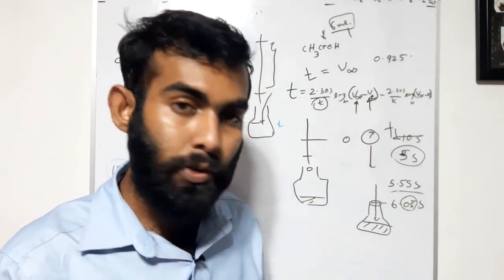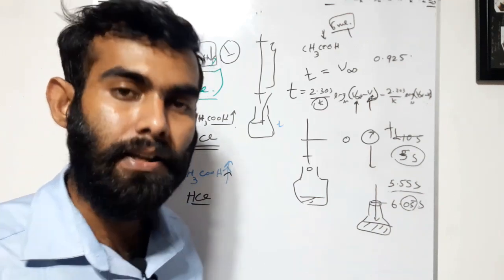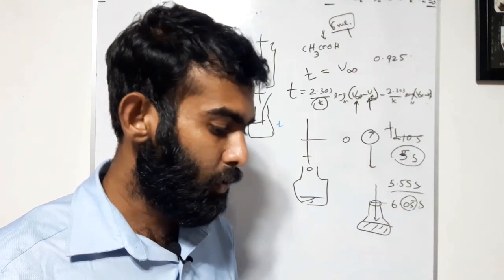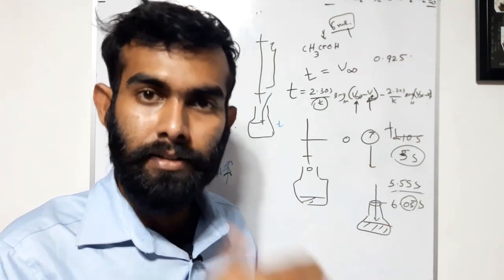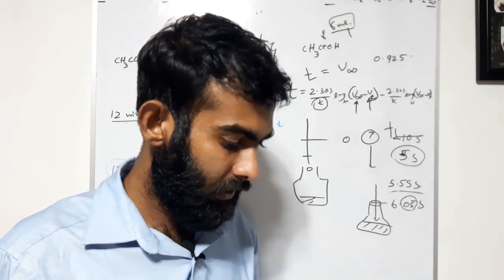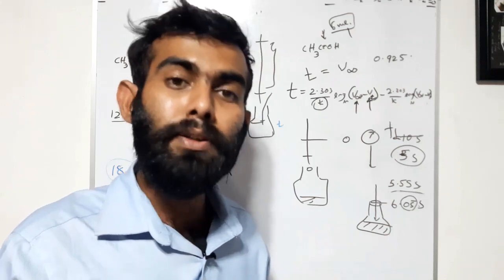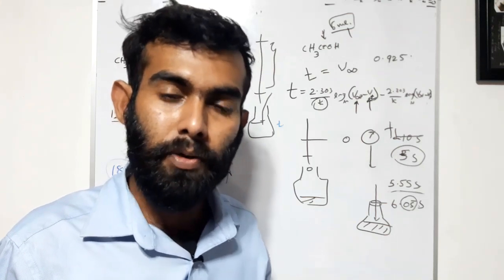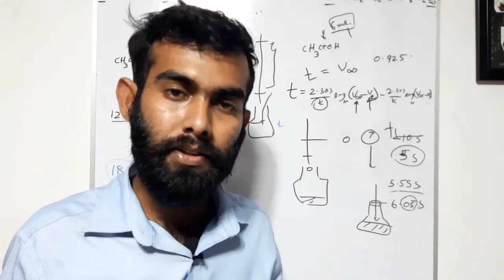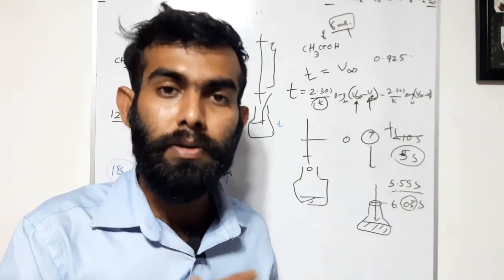Okay, we have to use a water bath for this reaction and we are using phenolphthalein as the indicator. We have to use a white tile in every titration to observe the color change, colorless to pink. We have to shake or swirl every solution during this experiment because we have to get a uniform temperature, a uniform reaction mixture. So we have to stir, shake or swirl this solution very well every time.